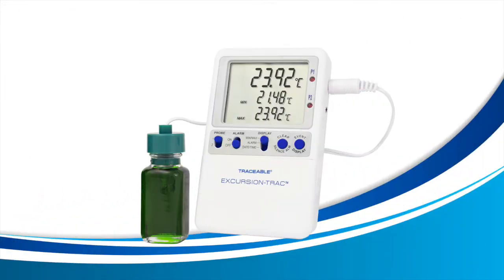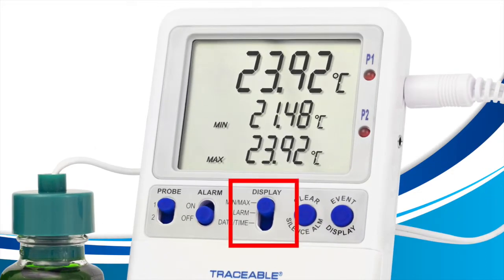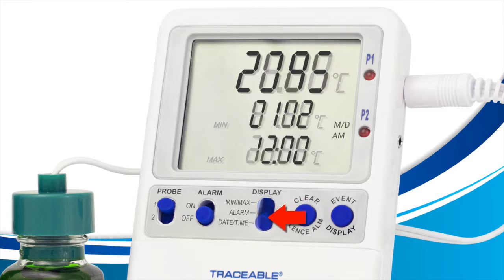Preparing your device to set the day and time. To complete this lesson, we're going to use the display switch located at the center here, and then the display event switch located towards the right over here. Let's start with the display switch. Using your finger, slide the display switch down until it aligns with the words date/time as shown here. Once you align it with date/time, your display will change.